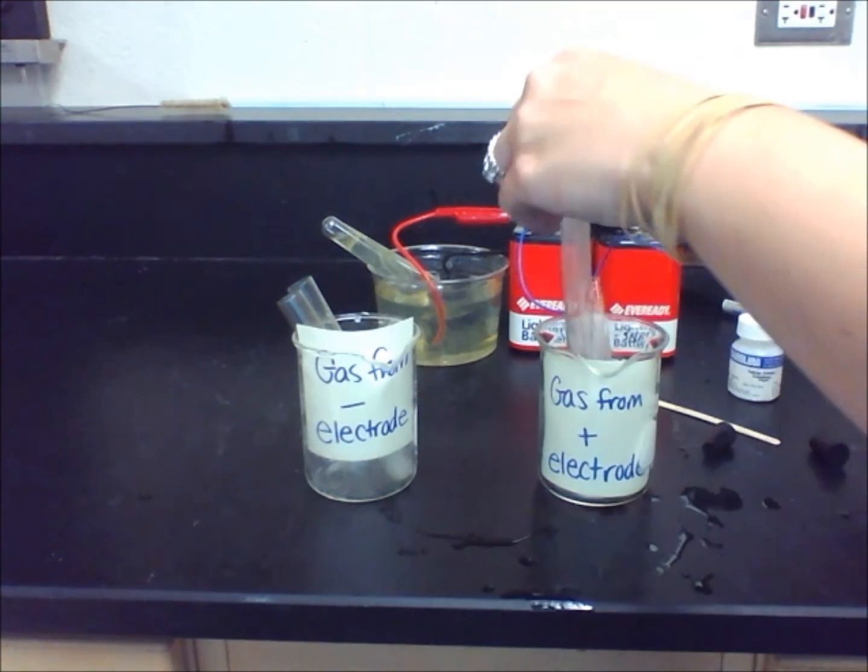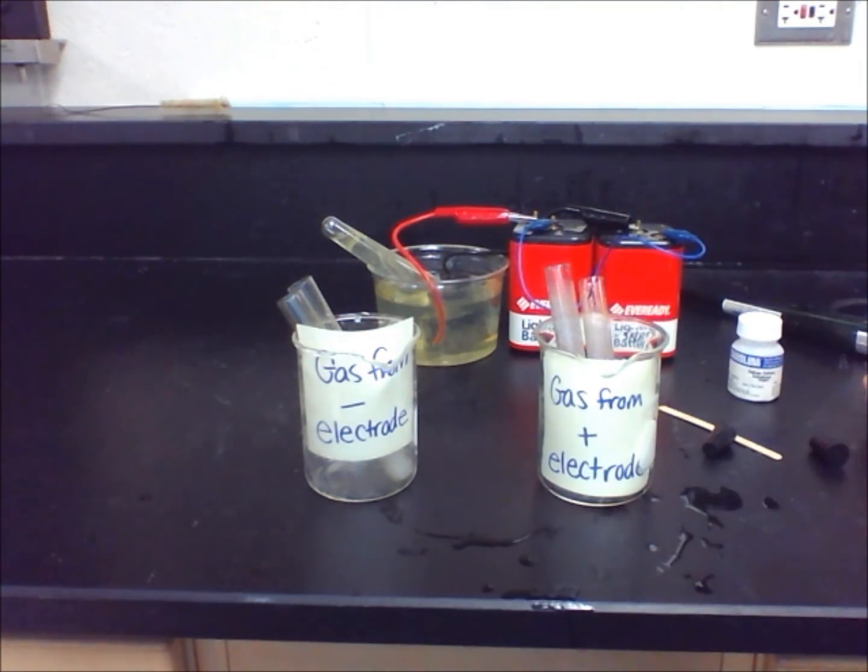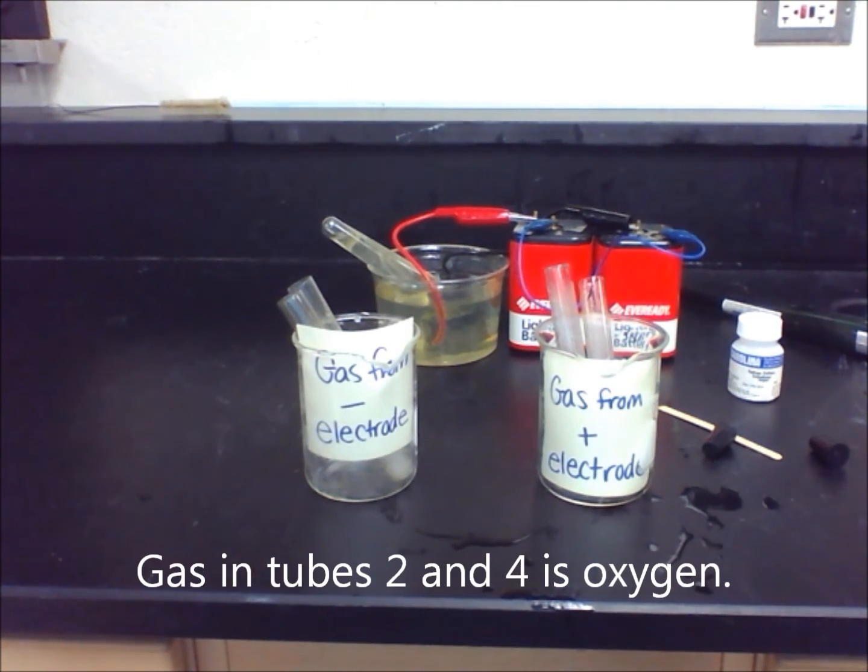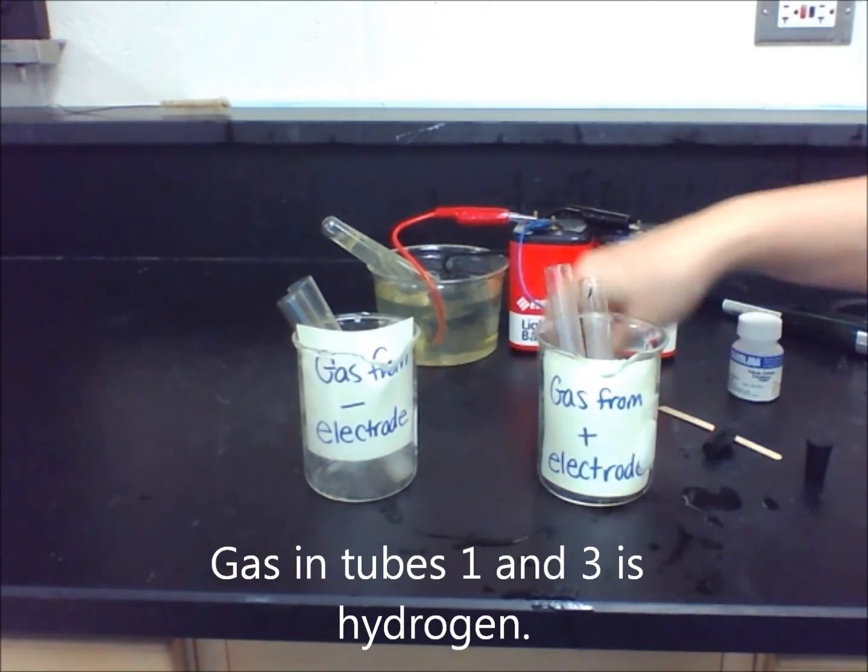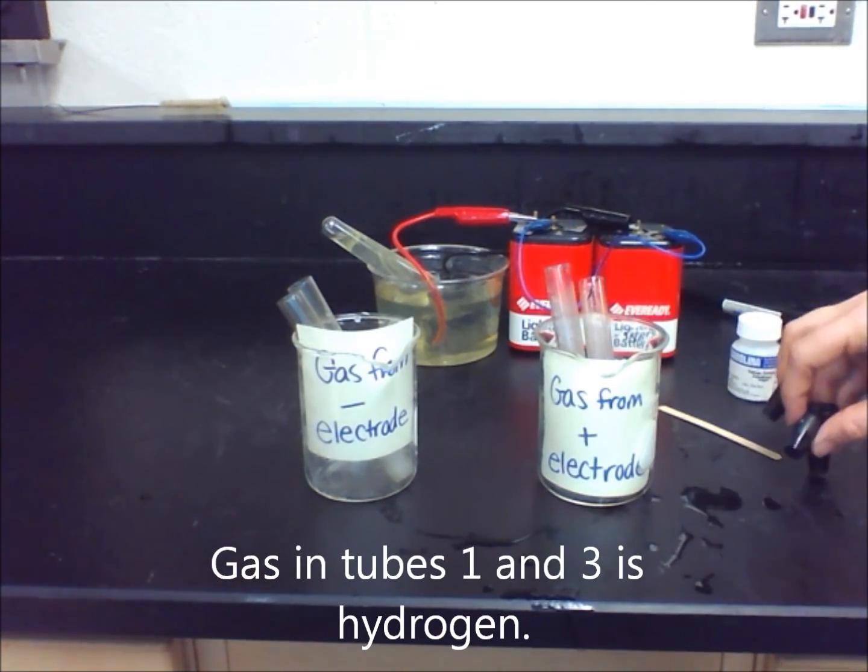Using the observations in tubes 2 and 4 for the gas produced above the positive electrode, we can tell that it is oxygen because it didn't make a noise but helped the fire to burn. Using the observations in the table about the gas in tubes 1 and 3, you can tell the gas is hydrogen because it was highly reactive and popped but did not help the fire to burn.